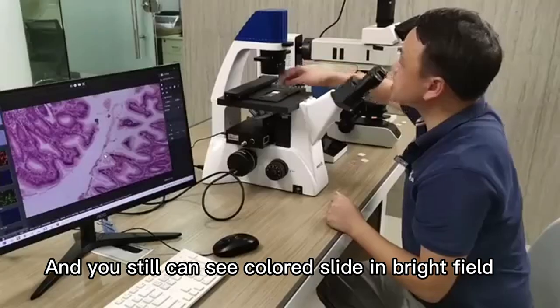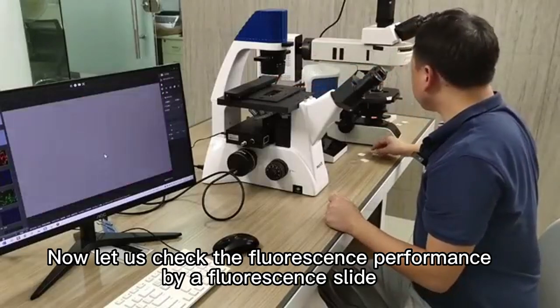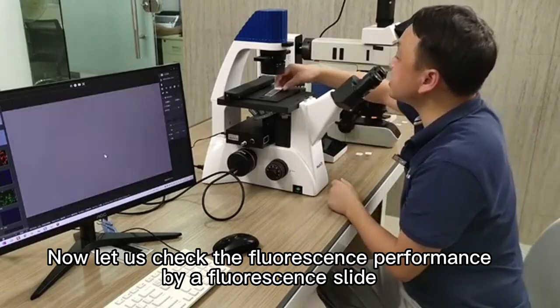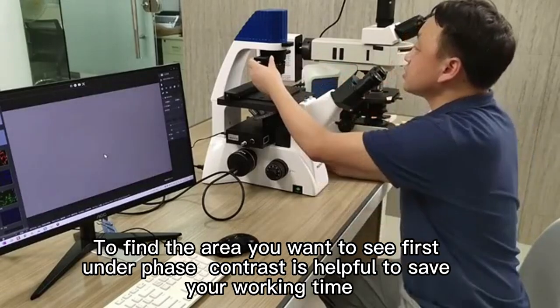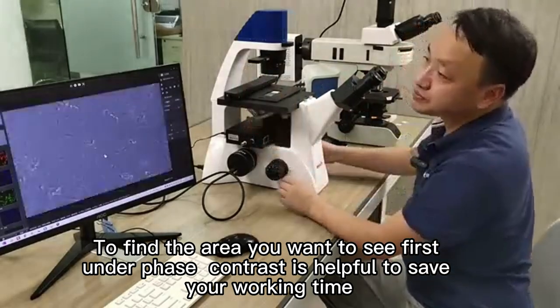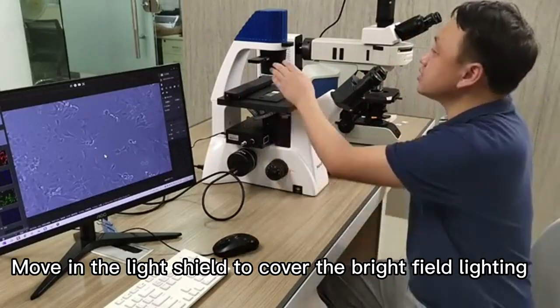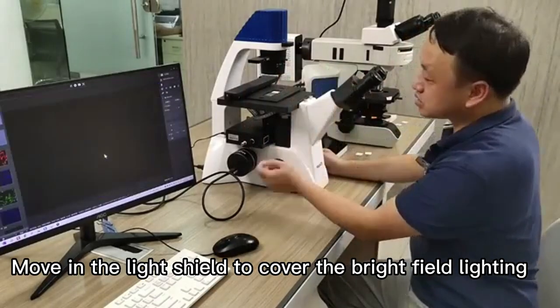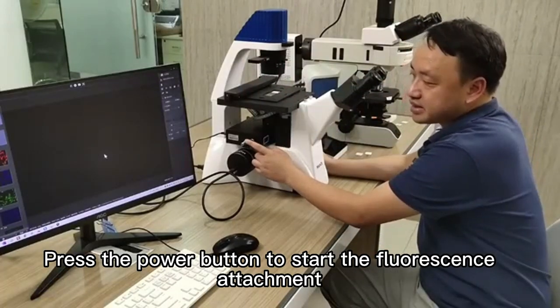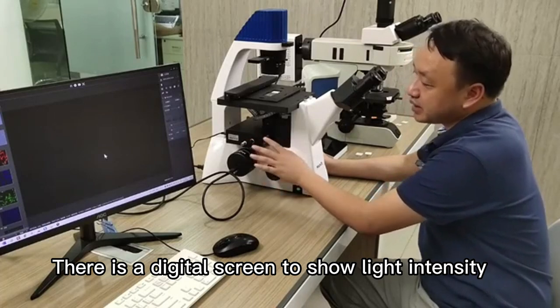Sharpness is important for transparent cells. You can still see colored slides in bright field. Now let us check the fluorescence performance. Use a fluorescence slide and find the area you want to see first. Using phase contrast is helpful to save your working time. Then move in the light shield to cover the bright field lighting and press the power button to start the fluorescence attachment.